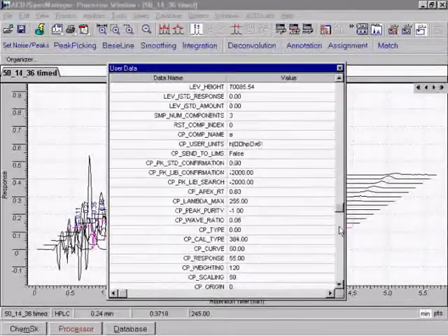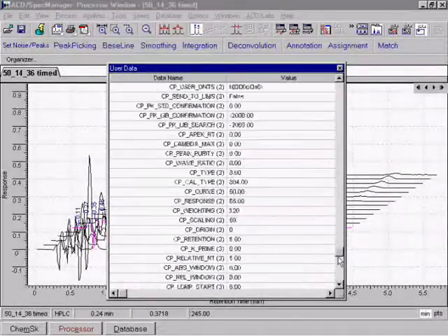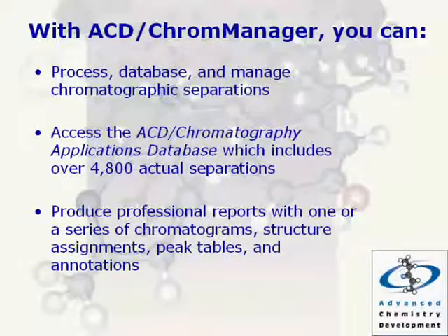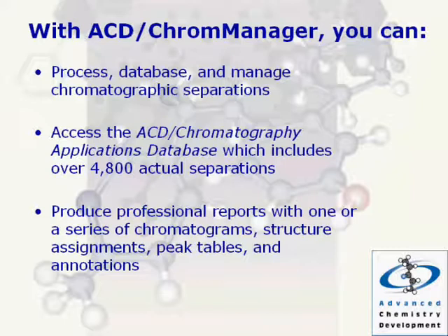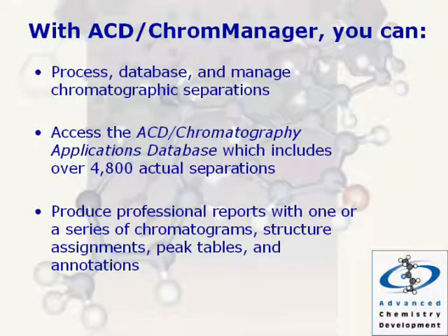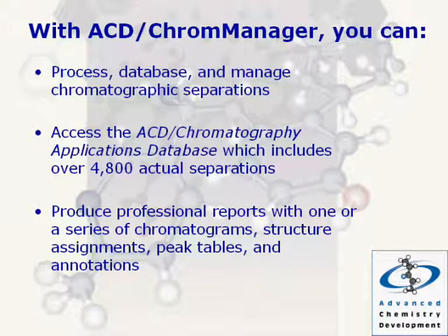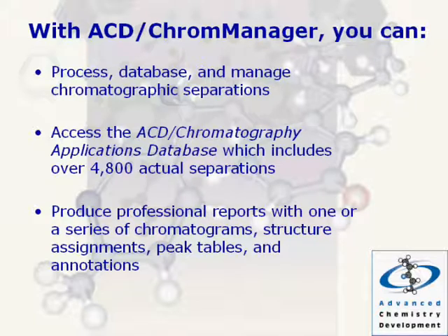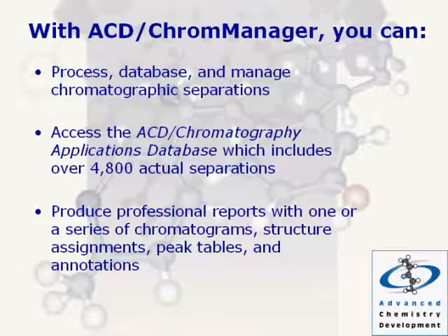With ACD Chrome Manager, you can process, database, and manage chromatographic separations. Access the ACD Chromatography Applications database, which includes over 4,800 actual separations.